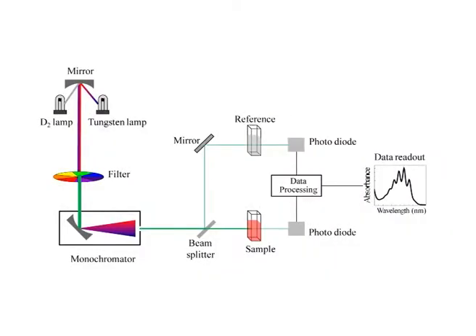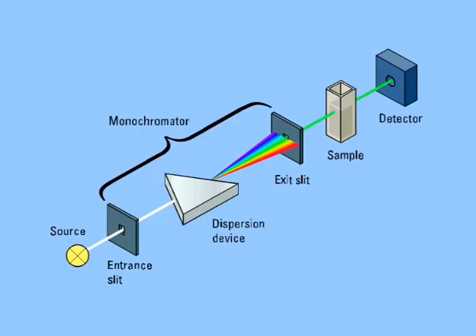Absorption takes place when energy from the radiative source is absorbed by the material. Extent of absorption is measured by measuring the fraction of energy transmitted through the material. Absorption will decrease the transmitted portion. This is known as absorption spectroscopy, for example, UV visible spectroscopy.